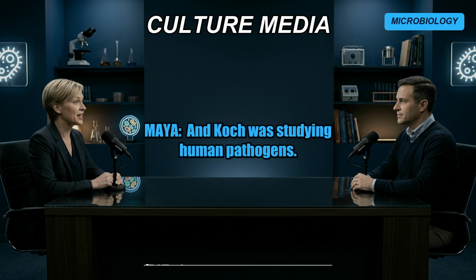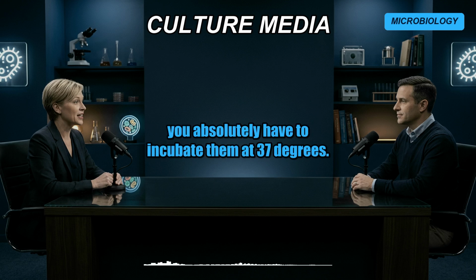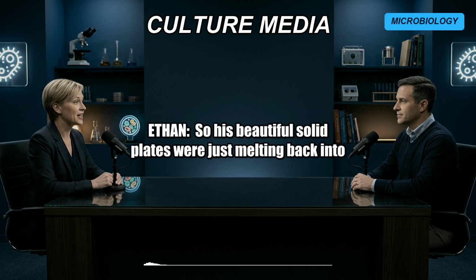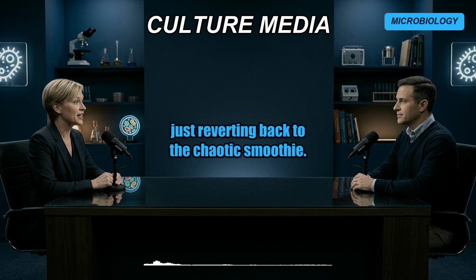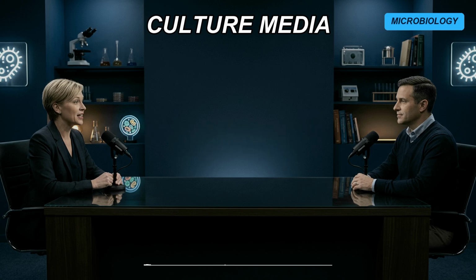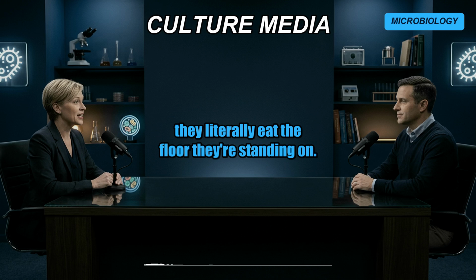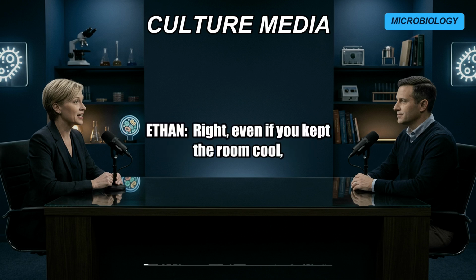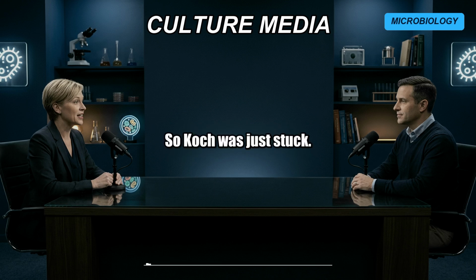Oh, right. And Koch was studying human pathogens. Yeah. To get them to grow, you absolutely have to incubate them at 37 degrees. So his beautiful solid plates were just melting into muddy puddles in the incubator. Exactly, just reverting back to the chaotic smoothie. And the second problem is purely biological. Many bacteria produce enzymes called gelatinases that actually digest gelatin. Yeah, they literally eat the floor they're standing on. Right. Even if you kept the room cool, the bacteria would liquefy the whole plate. So Koch was just stuck.